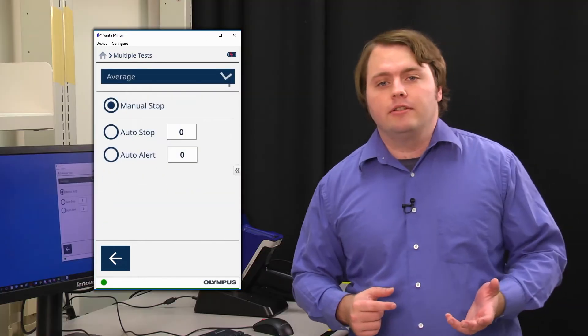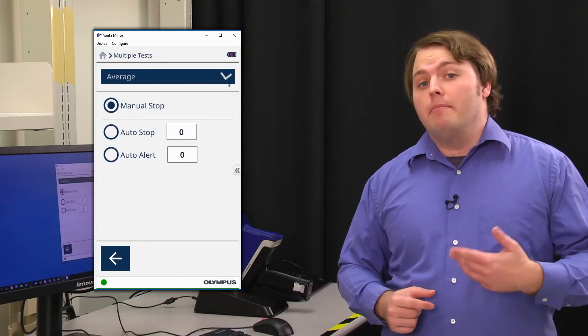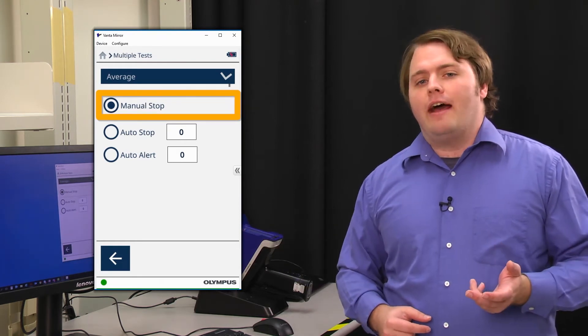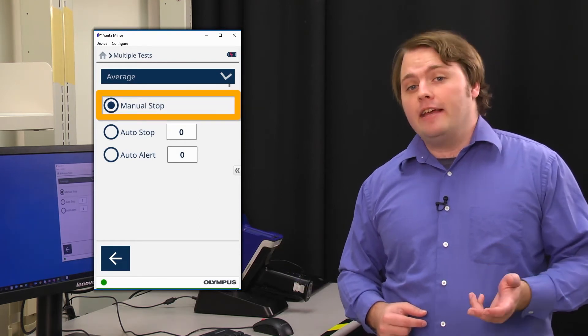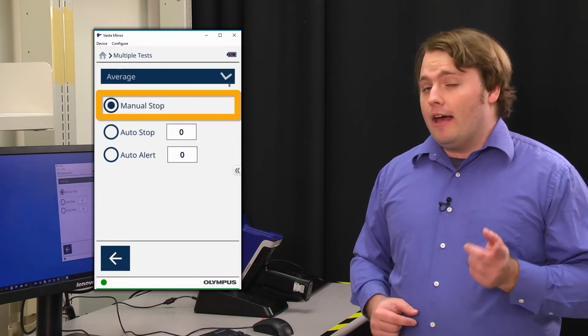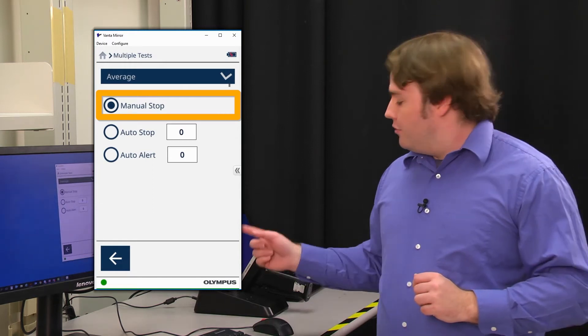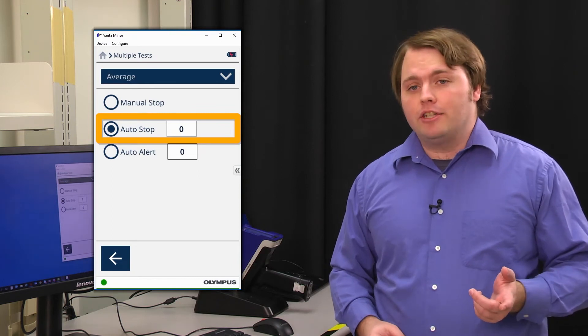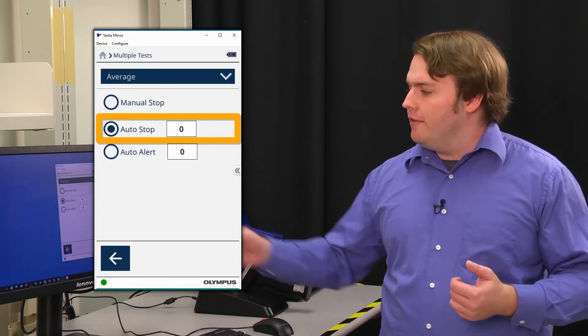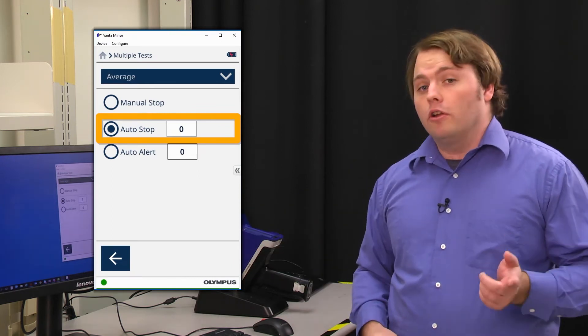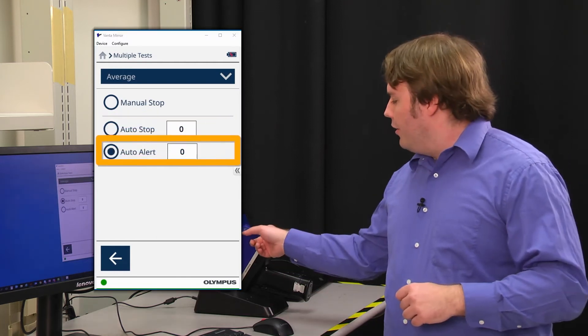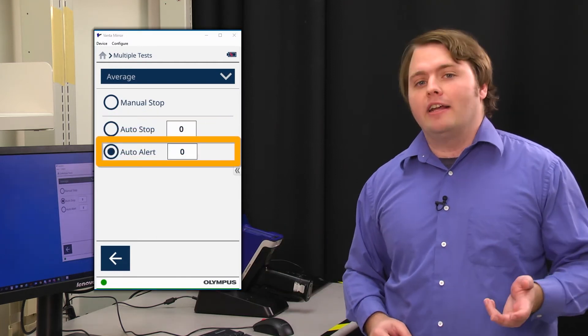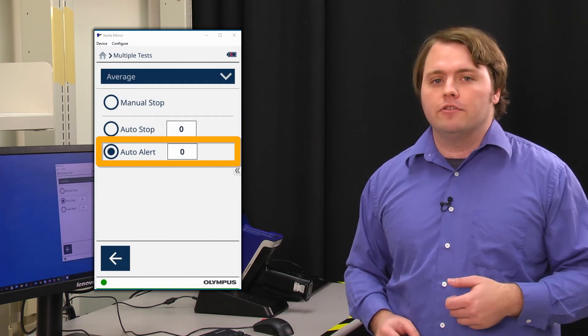Here there are several options available to you to create an average. Manual stop will let you manually generate an average from set test results as you take them. In addition to that, we have automatic options, such as auto stop, which will automatically generate an average after the set number of tests in the field to the right there. Auto alert functions similarly, but will alert you and give you the option to generate an average or skip generating an average after that set number of test results.